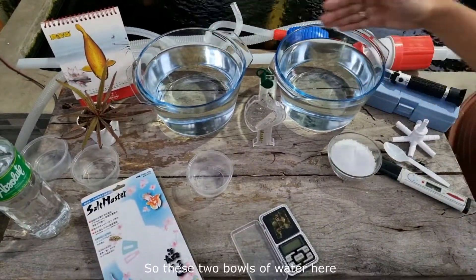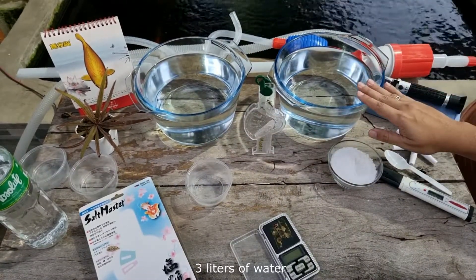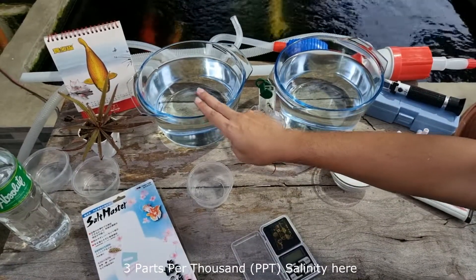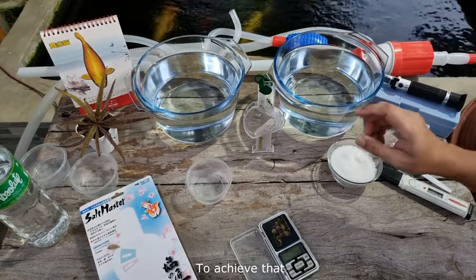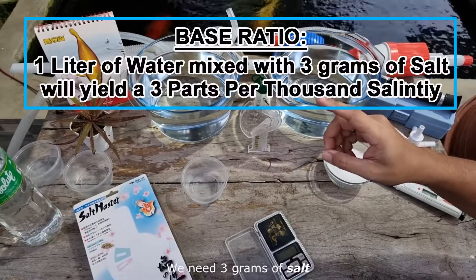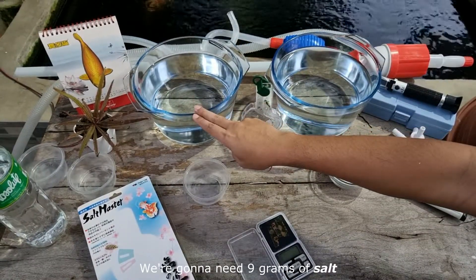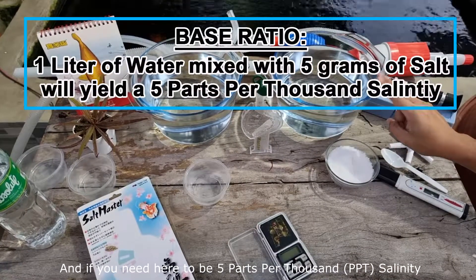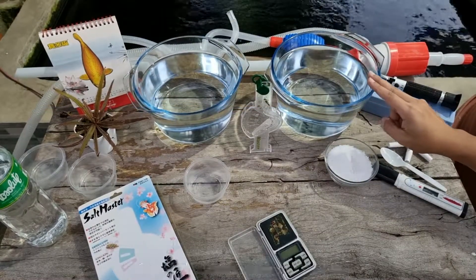We have two bowls of water here, three liters per bowl. We're going to do a 3 parts per thousand salinity in one bowl and 5 parts per thousand in the other. To achieve 3ppt, we need 3 grams per liter — so for 3 liters that's 9 grams. For 5ppt, that's 3 times 5 equals 15 grams.